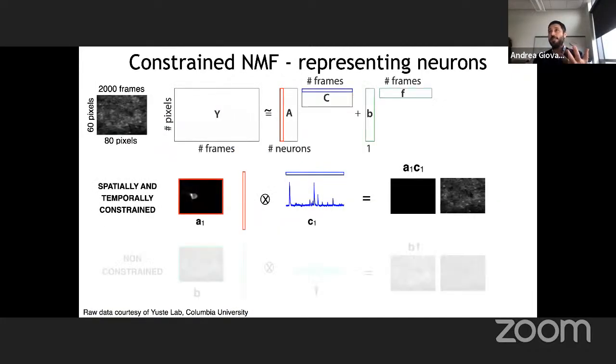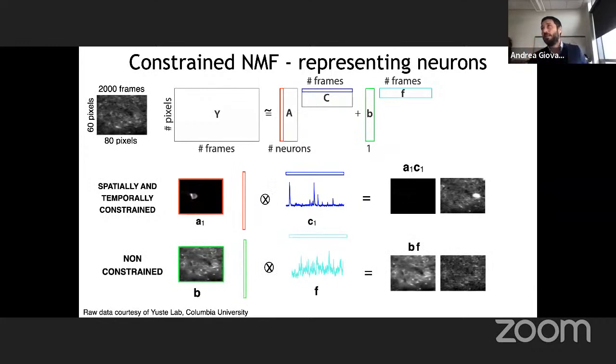This model basically tells you that if you find a set of pixels which are highly correlated in time, then you express the activity of these highly correlated pixels as this product. So the assumption is that there is a set of pixels that go up and down together. And you can have 2 different places in which this happens. You can have 3 places in which it happens.